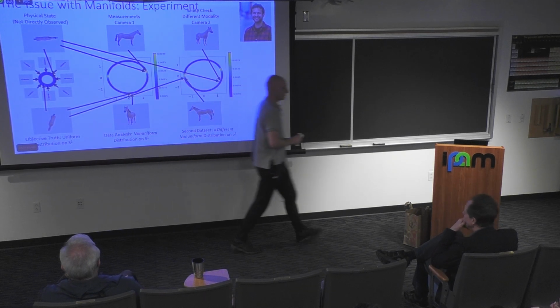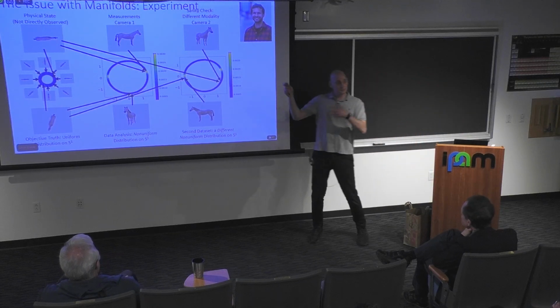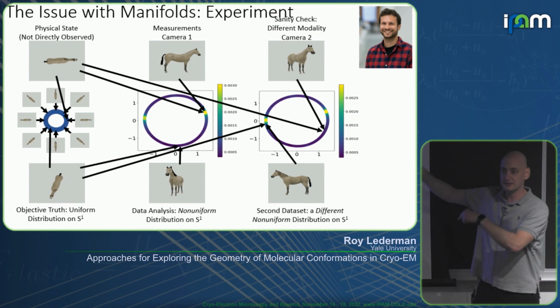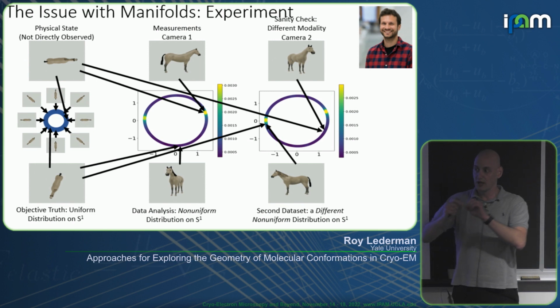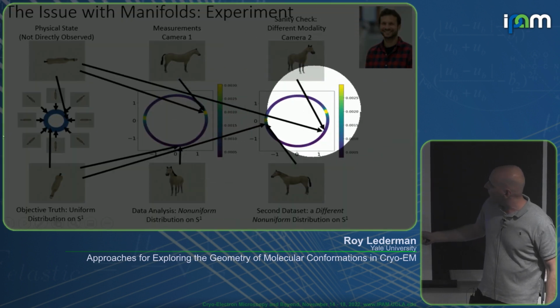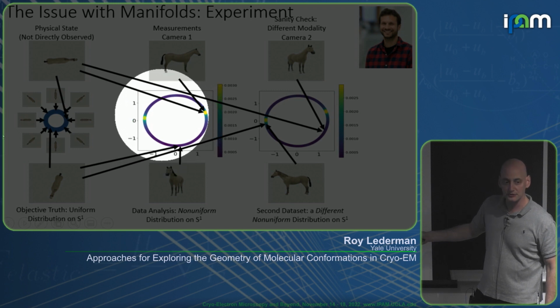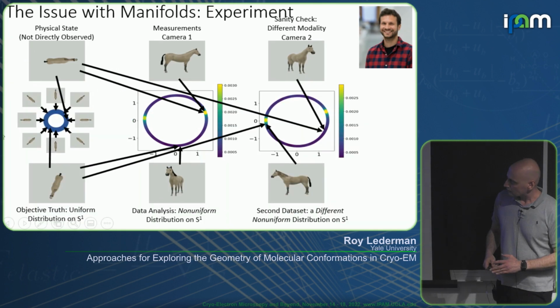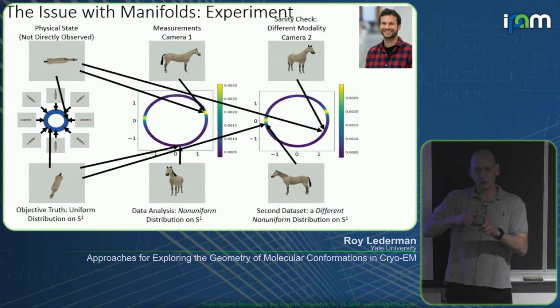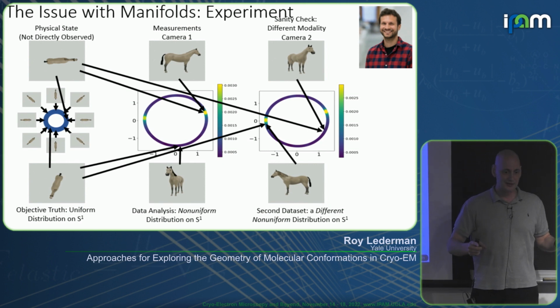And we take these images of the same states, and we do diffusion maps on them. Again, we get a beautiful circle, and again, it has these regions of high density. But these regions of high density are connected with other physical states than what we measure here. So both solutions are wrong in a sense, and they don't agree with each other, okay?